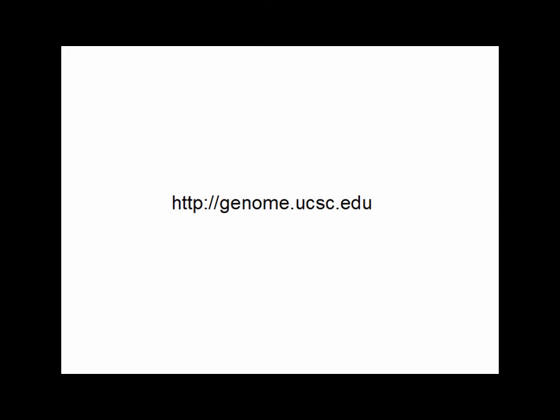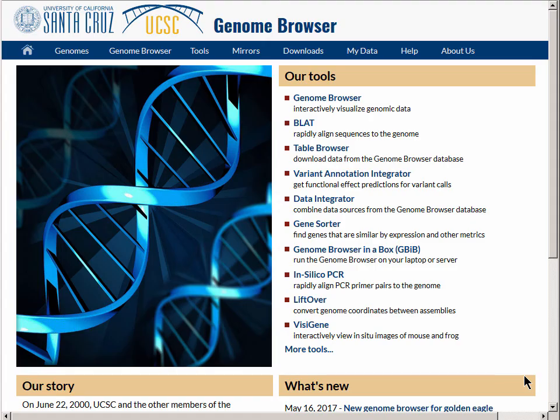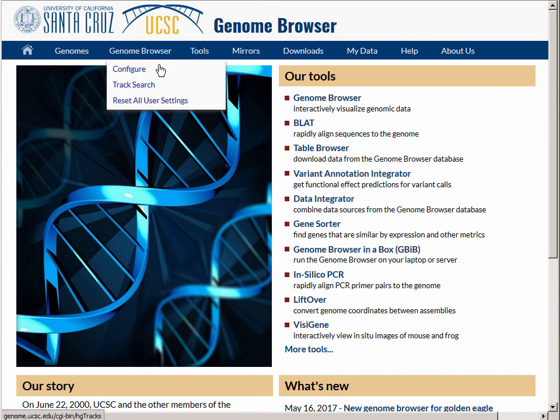We will begin at genome.ucsc.edu, the home page, and we will begin by setting the browser to its defaults, starting with the Genome Browser link in the pull-down menu, and reset all user settings.